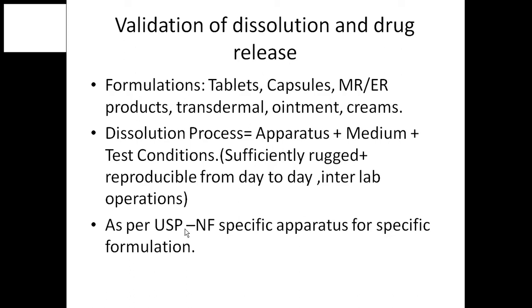One thing we have to always remember is that my dissolution process should be sufficiently rugged, reproducible from day to day, and in interlab operations. That suggests that whatever dissolution test is followed by a particular analyst in one lab should be reproducible in another lab, maybe in another place, by a separate analyst. So that gives the ruggedness or reproducibility of the particular dissolution process.